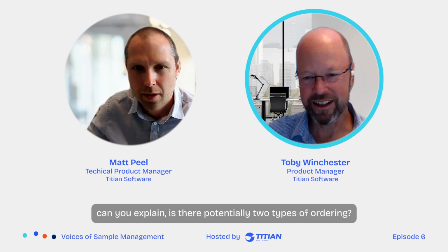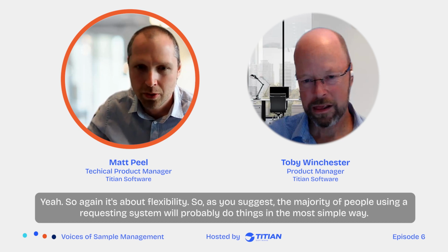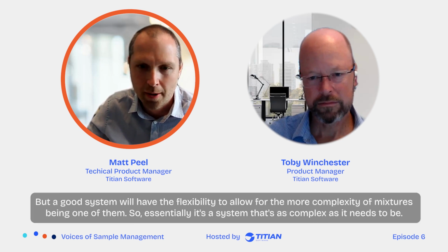Can you explain? Is there potentially two types of ordering? Yeah, so again, it's about flexibility. As you suggest, the majority of people using a requesting system will probably do things in the most simple way, just add their items and click go. But a good system will have the flexibility to allow for more complexity, mixtures being one of them.